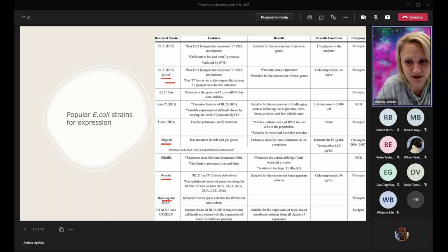They grow a little bit slowly, and this is also good for expression. Generally, slower growing bacteria give less background. And what's also interesting, those bacteria do modify DNA. So, for example, we cannot use them to propagate plasmids for molecular biology because the plasmids will be methylated, and as you may remember, some restriction enzymes are sensitive to methylation. So if you want to produce DNA, you will not use those strains. Then we use methylation-deficient strains.